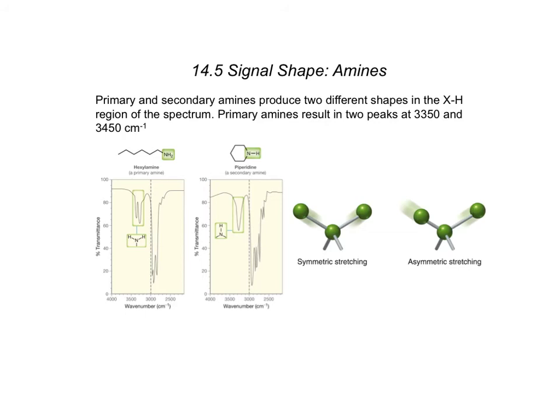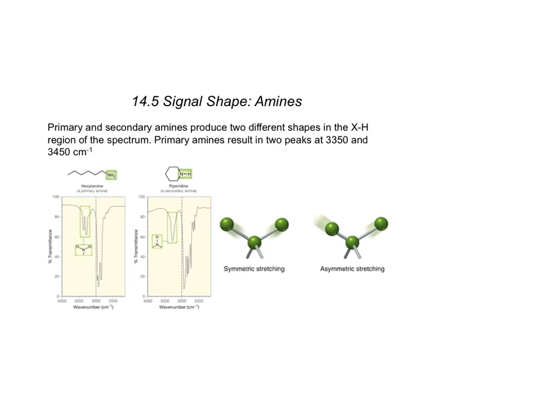It has nitrogen. Let's say that nitrogen on one side is attached to other alkyl groups, other carbons, whatever. What else does nitrogen have to be attached to, though? It has to be attached to a hydrogen, right? So when we're looking for amines, we're specifically looking for this bond, right? Again, it's nitrogen attached to a hydrogen.